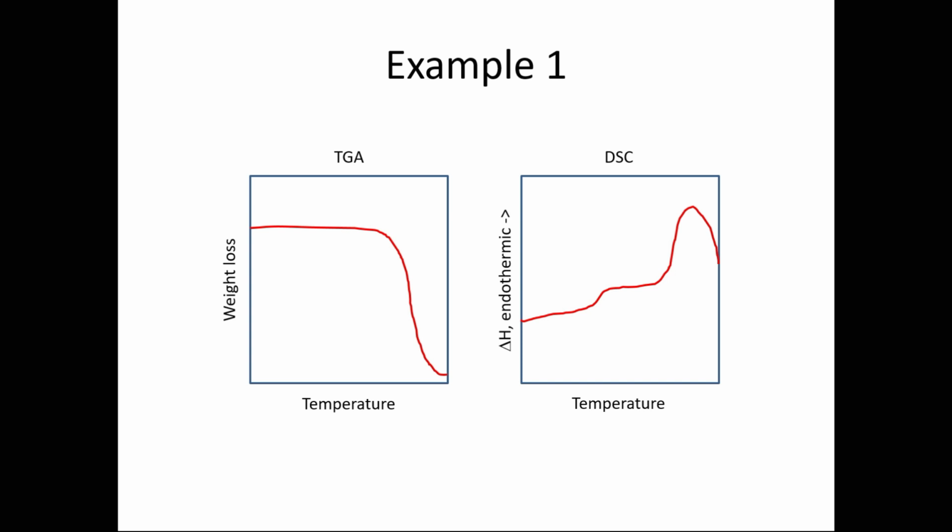The confirmation that it is a glass transition temperature also comes from looking at the TGA diagram, because on TGA in this temperature range we don't see any thermal events. Why is that? Because glass transition is not accompanied by a loss of sample weight. So the material just gets softer. So the first phenomenon is a glass transition temperature.